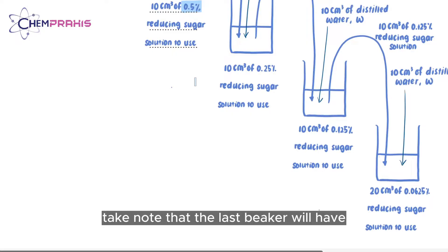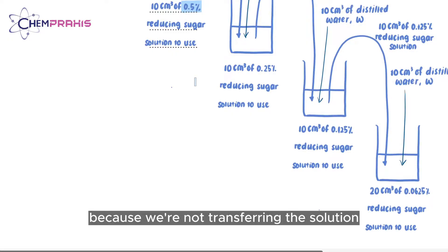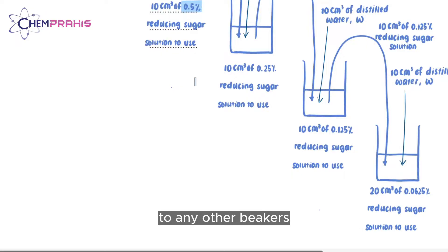Take note that the last beaker will have 20 cm³ of reducing sugar solution because we're not transferring the solution to any other beakers.